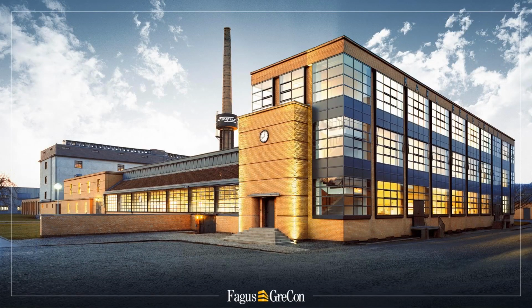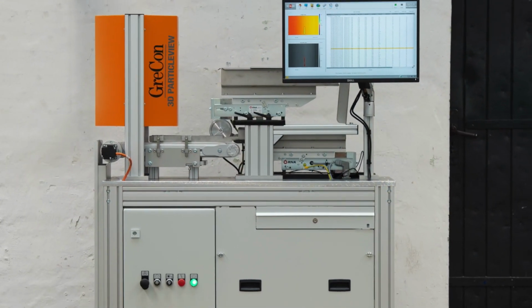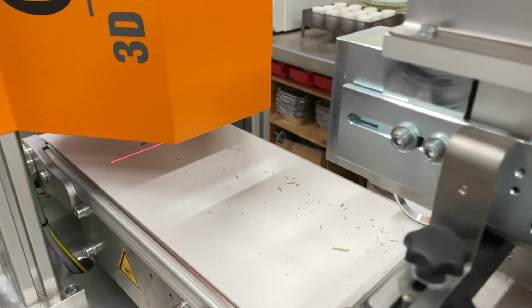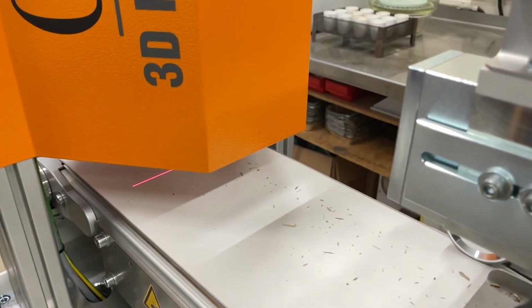Welcome to the presentation of the 3D particle view. In this video we will show you what the 3D particle view can do for you and which improvements will result for you. What is a 3D particle view? It is a system for optical particle measurement to optimize particle properties.